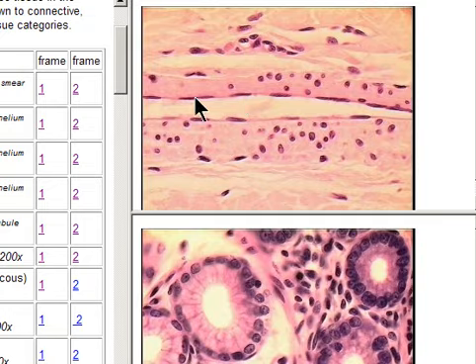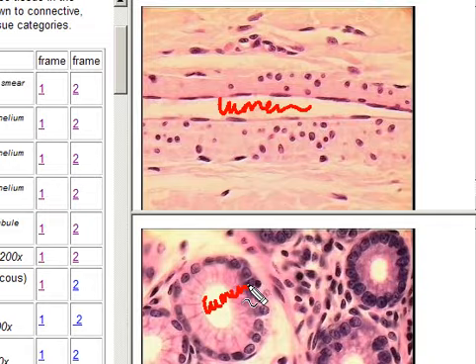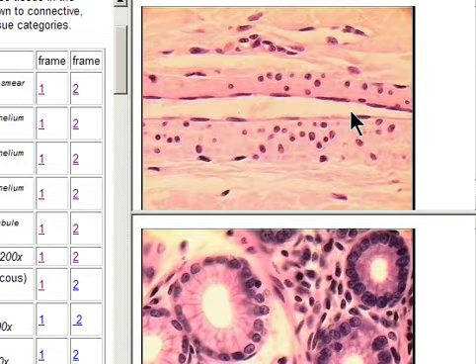You can see that these are flattened, and in case of epithelium, you invariably find an open space, which if it's the inside of a cavity, we call the lumen. So this is the lumen up here. Here also, look at this, an open space, so that's the lumen. Or if it is skin, for example, on the outside, again you will see open space. So one surface of the cell is always free, like over here. So you can see this is a simple squamous.